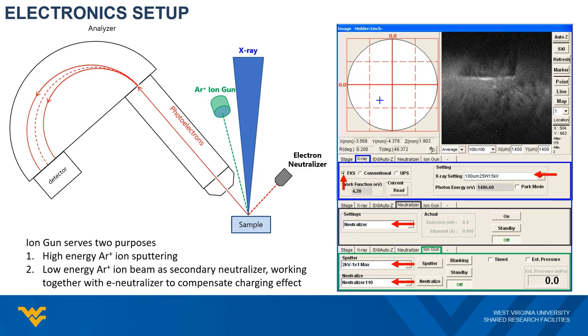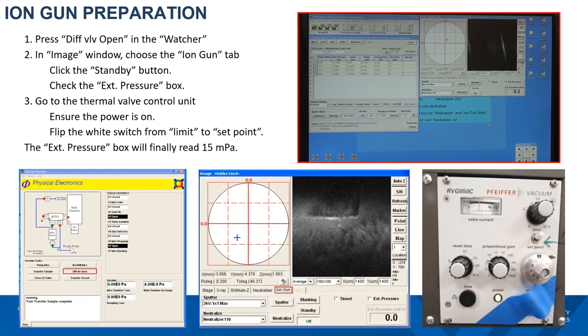The X-ray source and the electron neutralizer will be ready right after confirming the electronic settings. But for the argon ion gun, since argon gas is involved in its operation, we need to take an extra step to prepare the argon ion gun before its operation.